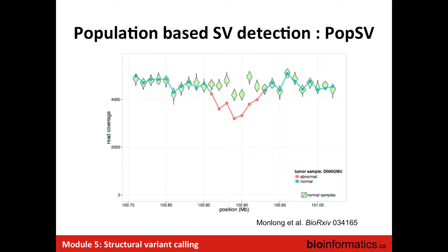Yeah? What's like a minimum number you would think for that to be valid? That's a tricky question. It's a PhD student that developed this method in the lab, and I still say you need to assess the real minimal number. We don't have a minimal number, but from experiments, from 10 to 15 samples, we're starting to have really good results, especially in low mappable regions and in repetitive regions.